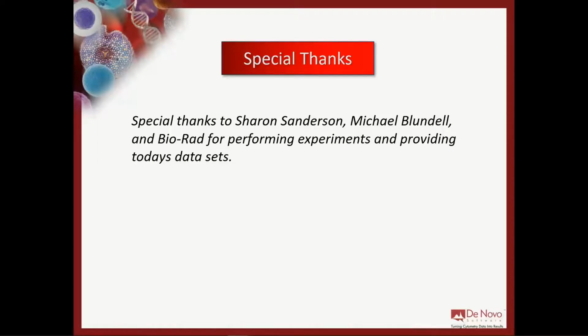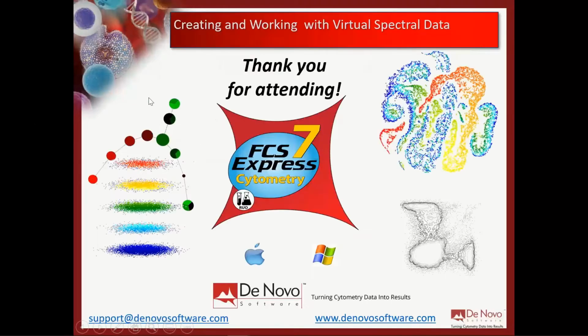Recently at Denovo Software, we've been having a lot of requests for folks asking, how do we do this? How do we perform virtual spectral conversion of data files? How do we do unmixing on that? And again, today is meant to serve as a practical overview of how to accomplish that. And we hope you can take that information home. You can download a demo. You can work with the version of FCS Express that you currently have and get that off and running.